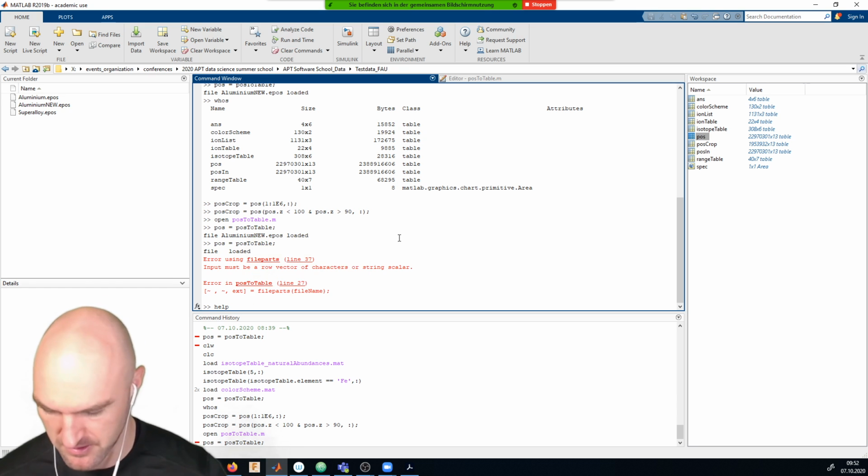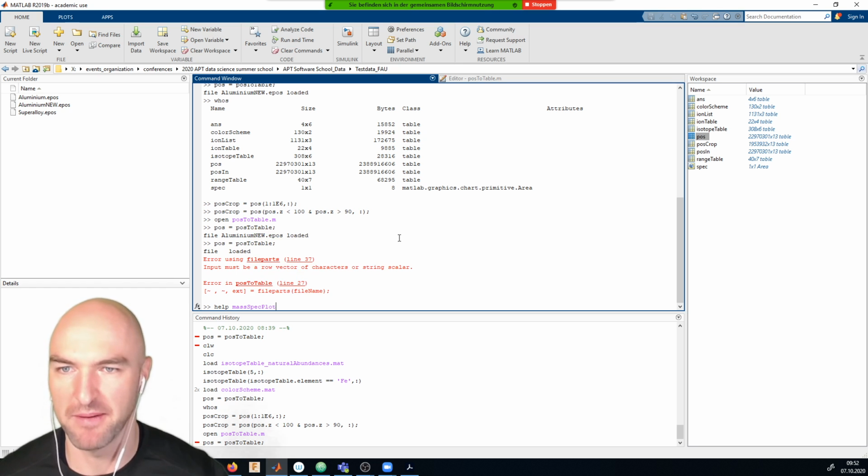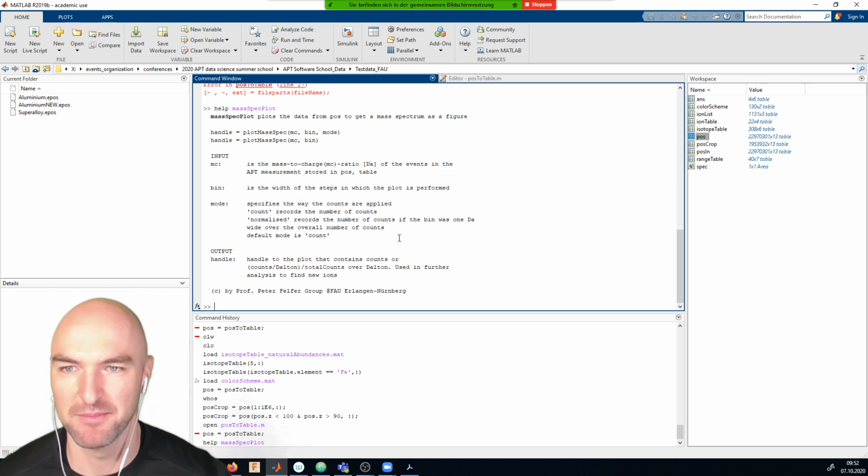Oh no, it's called mass spec plot by now. Sorry, mass spec plot.